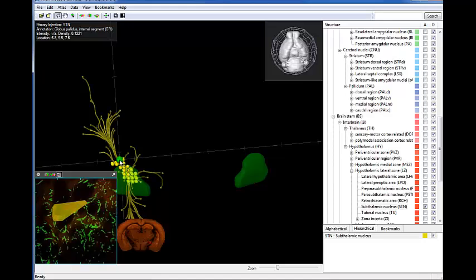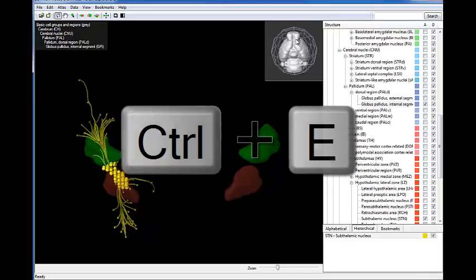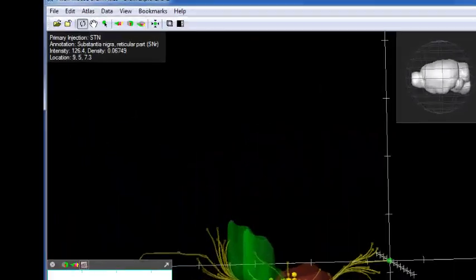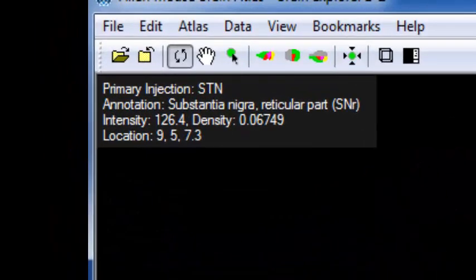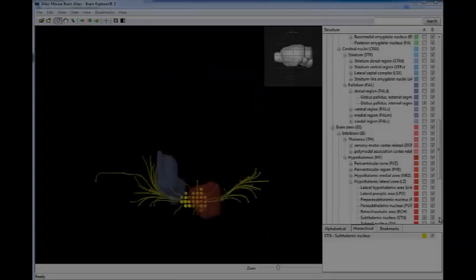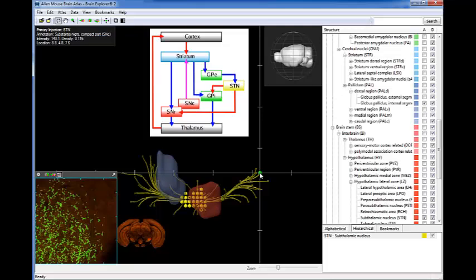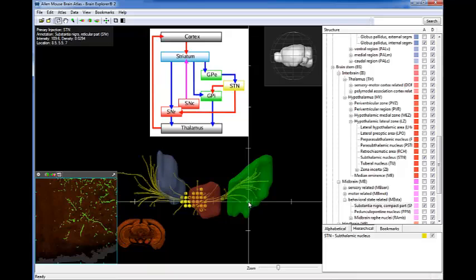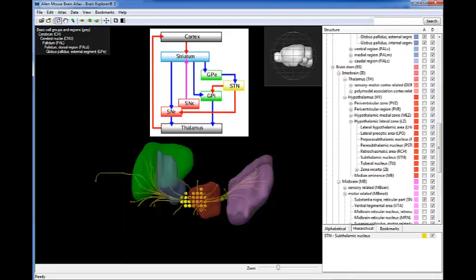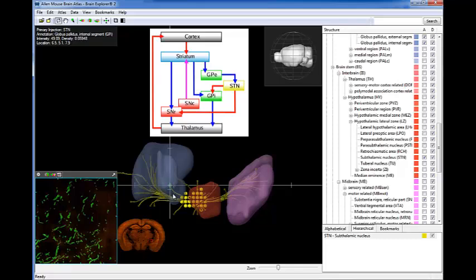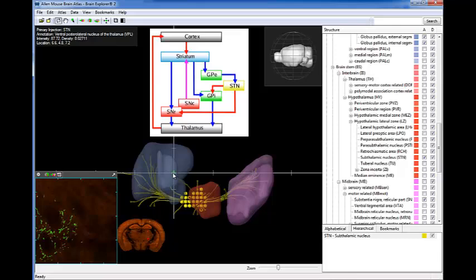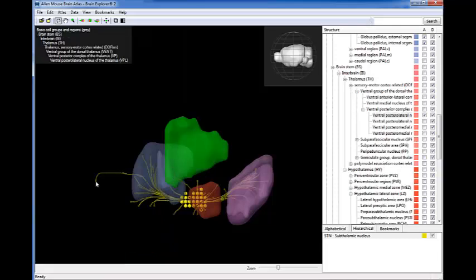You can add the reference atlas structure by clicking Ctrl-E when you've selected a region, indicated by the Structure Ontology box at the top left. From this single experiment, we can see several of the structures from our original diagram, the subthalamic nucleus projecting to both the substantia nigra reticular and compacta parts. We also see projections to the internal segment of the globus pallidus and to the thalamus.